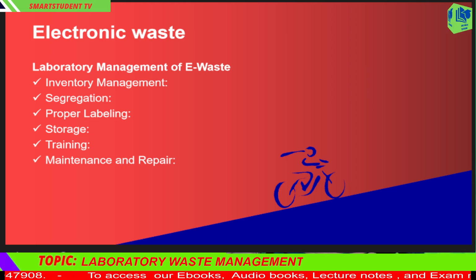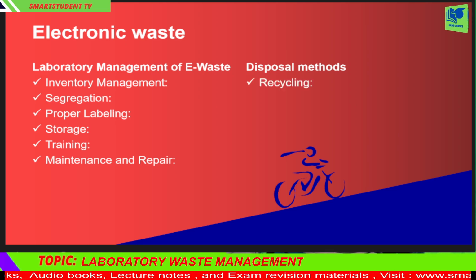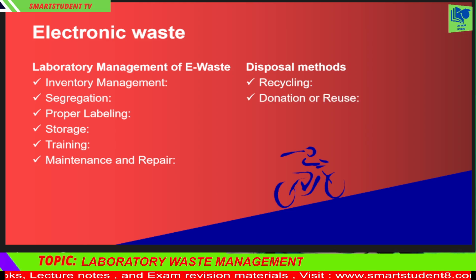6. Disposal methods for e-waste in laboratories. Disposal methods for laboratory e-waste include 1. Recycling. Send e-waste to certified recycling facilities. 2. Donation or reuse. Functional equipment can be donated to other laboratories or institutions.